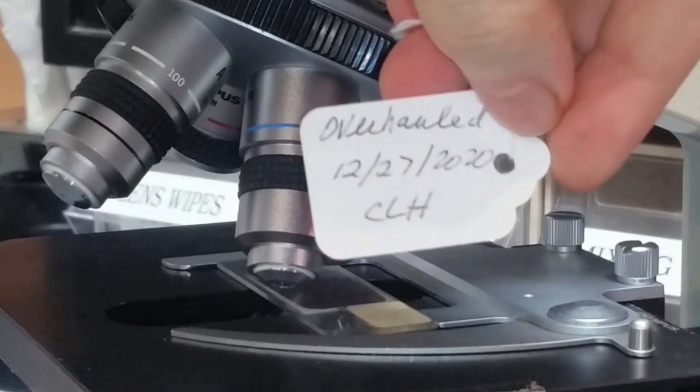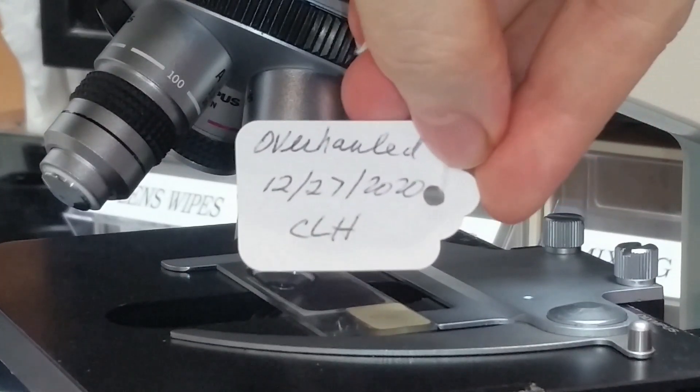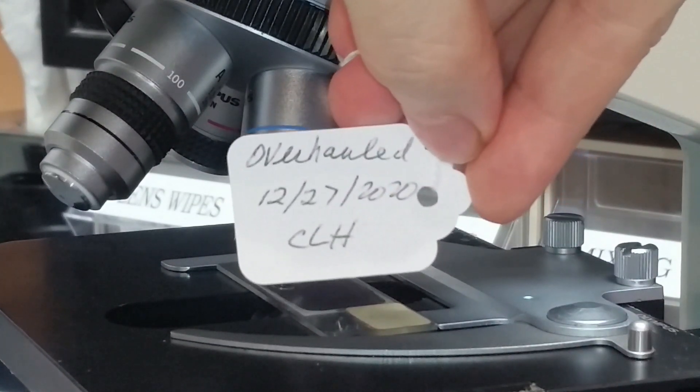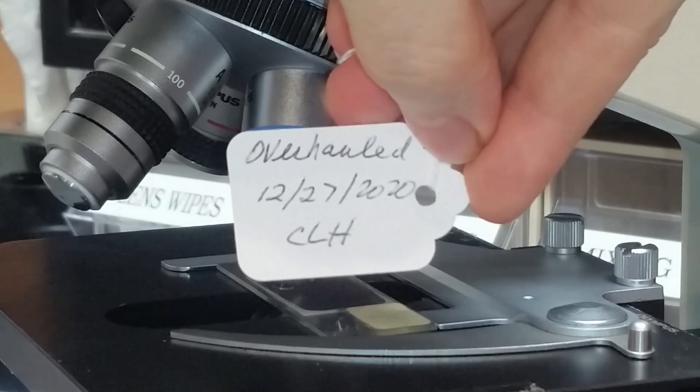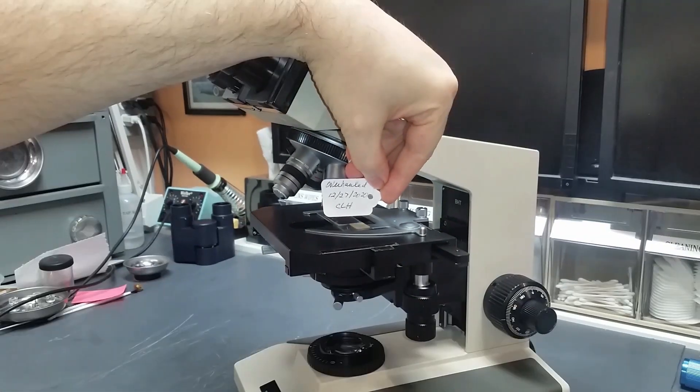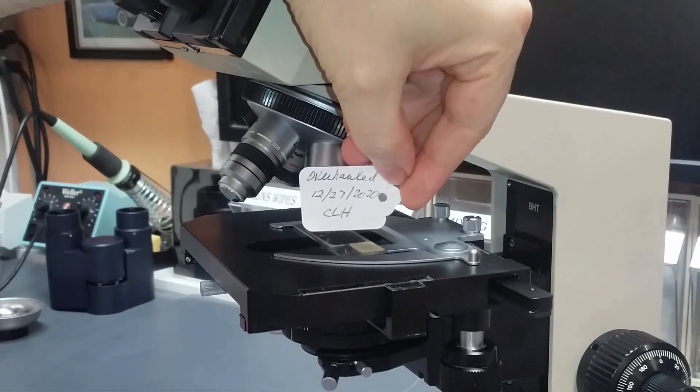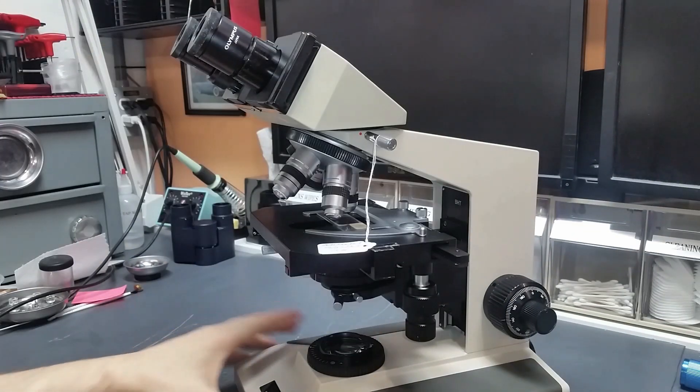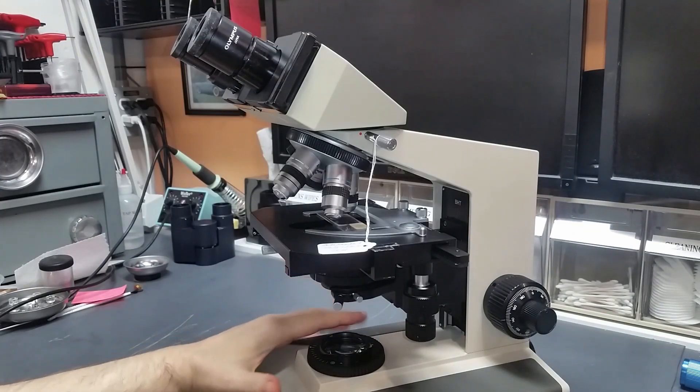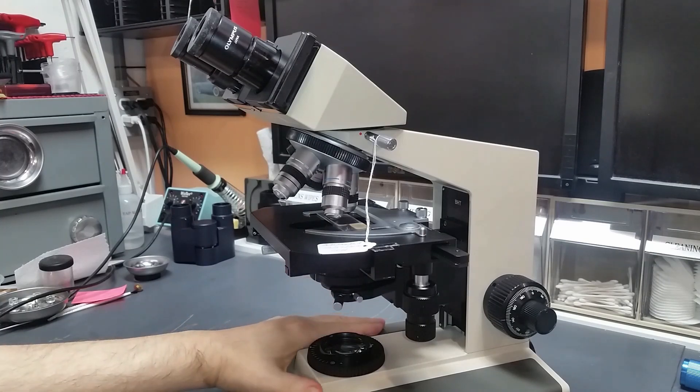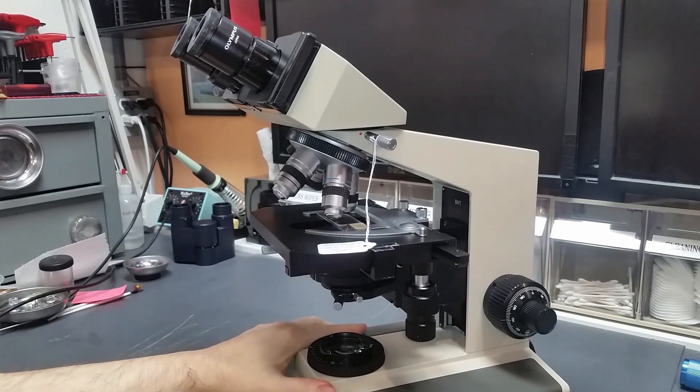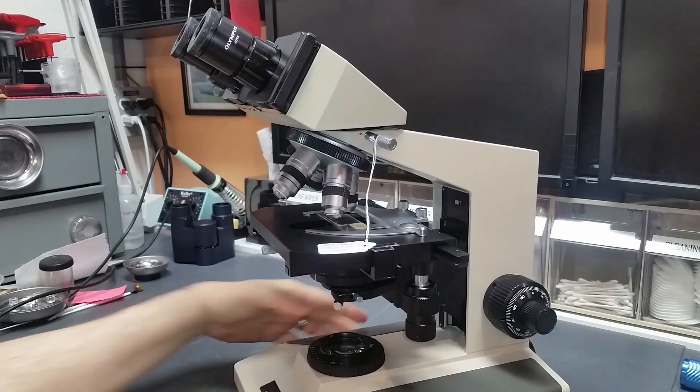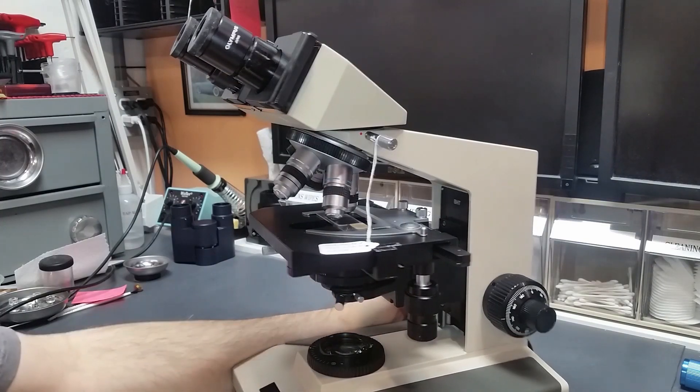Check out the toe tag. You can see it was done just a few days after Christmas. So this thing is in pretty good shape, fully overhauled and ready to go, ready to be put back to work. I'm going to be selling this to somebody.